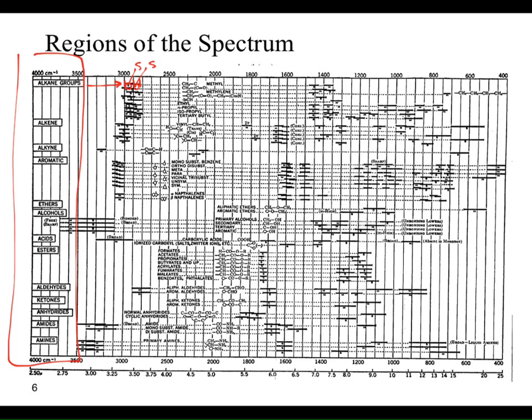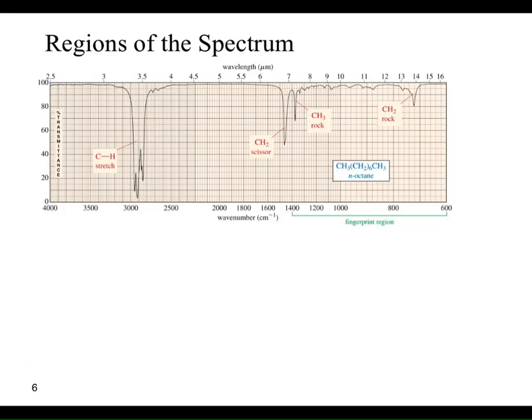Okay? That's ballpark what this is saying. It is very difficult to interpret this, so instead what I would do is practice. Look at a bunch of different spectra and start to get a feel for what things show up where. Practice is a bit tedious, but it's really your best bet when it comes to dealing with IR.